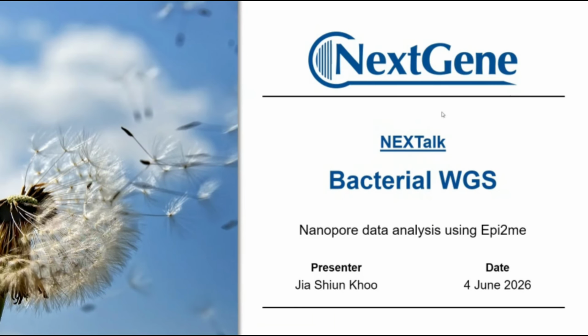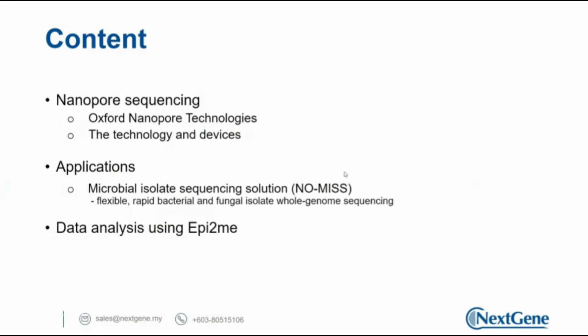Okay, so for today, we are going to talk a little bit about nanopore sequencing. We will spend a few minutes going through nanopore sequencing and the technologies, which we have also gone through several rounds in our past webinars. For participants who have just joined, we will have a very brief rehash. Then we will focus more on the microbial isolate sequencing solution, the NOMIS protocol, and go into the data analysis using the Epi2Me software at the end of the session.